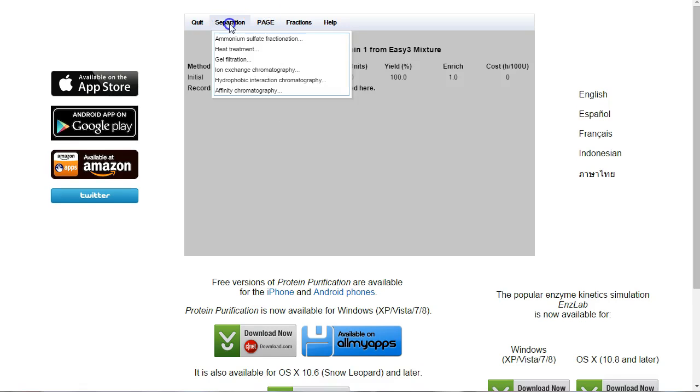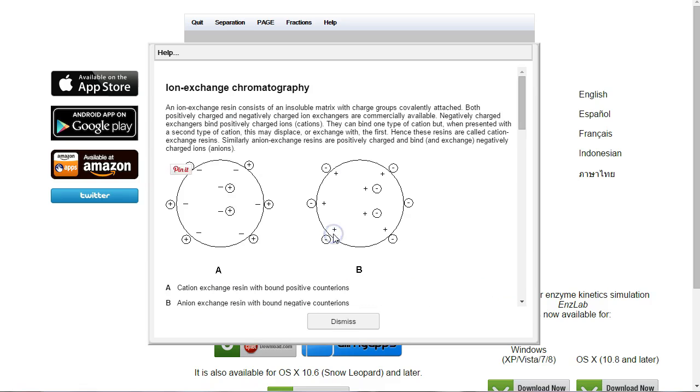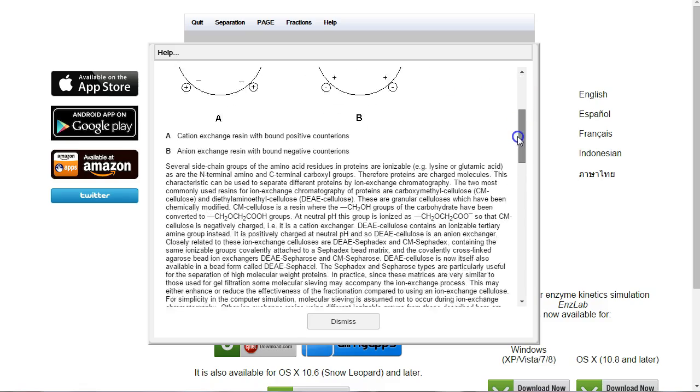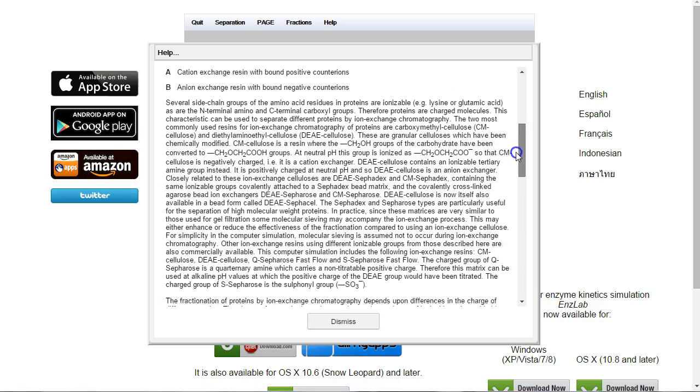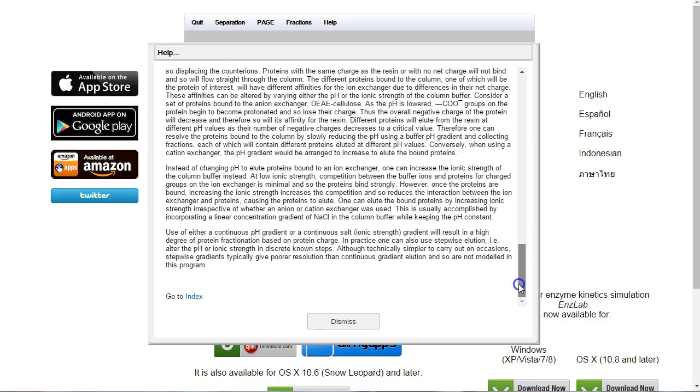Now we're going to go to Separation, and here we find ion exchange chromatography. It's given us a number of different examples, and if we click on Info, it'll tell us a little bit more about them. You can go and have a read through this information. There's lots and lots of detail here.